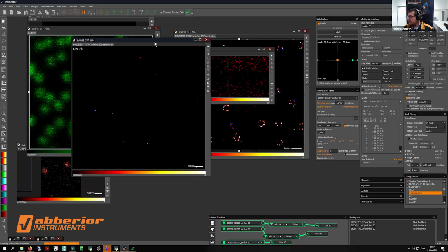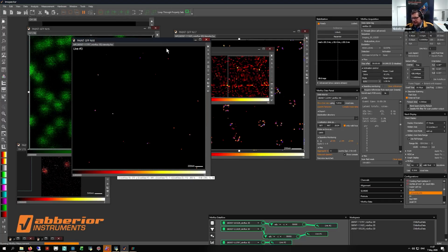That's it already. Do you have any questions concerning the 3D imaging and sequence? One important part I should comment on is that we use for our patterns these EOD settings for XY, the EOD scanner for XY positioning. But for the 3D scanning, we have to use the 3D donut and scan it also in the Z direction.